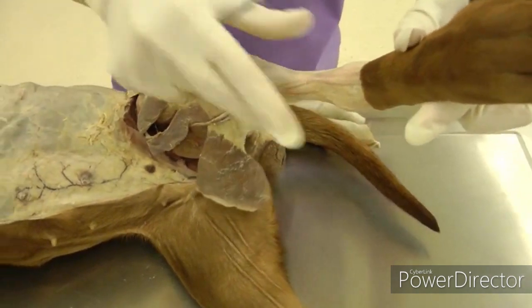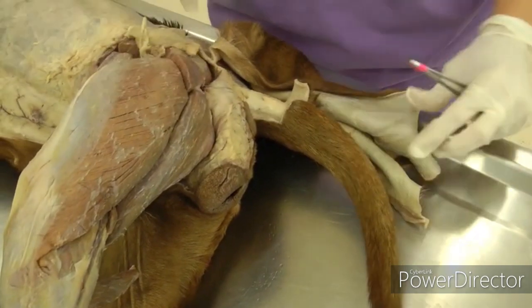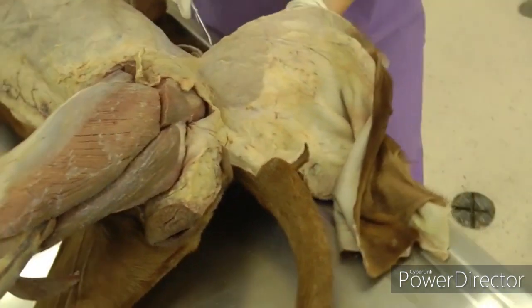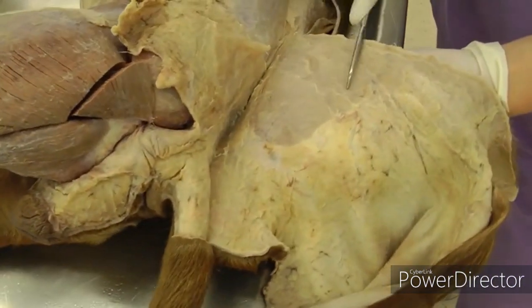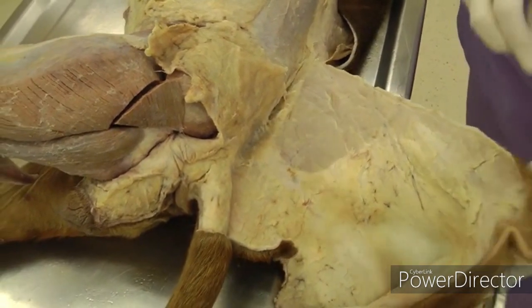Be very careful around the genitalia and skin that out as carefully and as close as you can. Also note that the remainder of the cutaneous trunci has been taken off with the skin — you don't need that on this part, so just take it off with the skin.